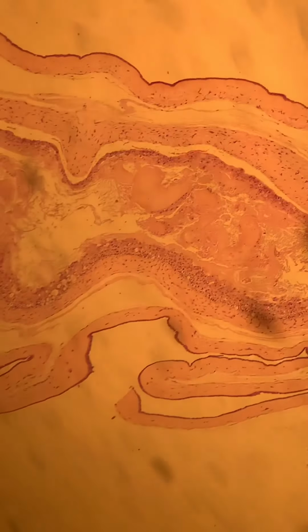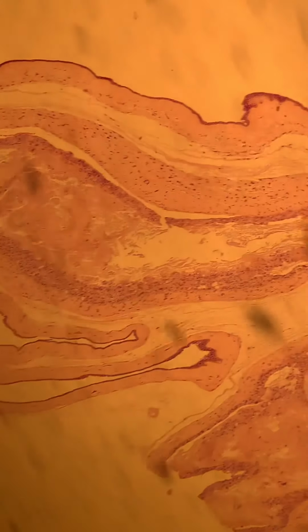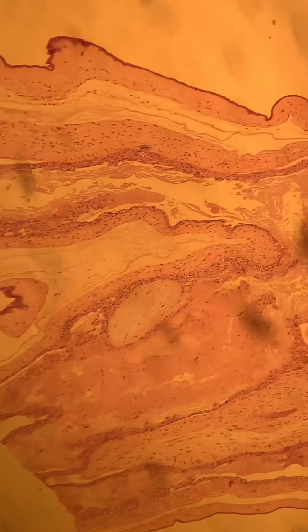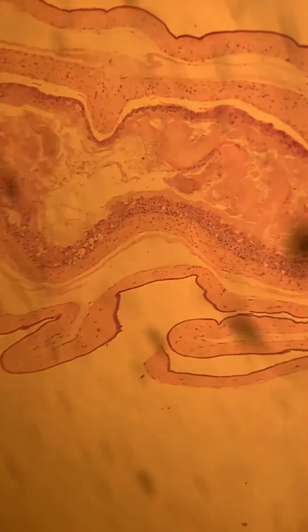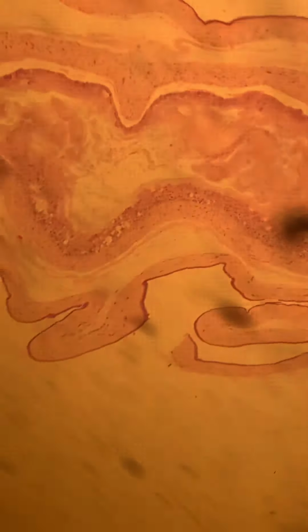The membranes from the transitional zone don't look as bad. But I want to stress that because there are some other pathologies that I'm going to show that highlight what I want to prove here in terms of the conditions surrounding the death of this fetus, this twin B fetus. Okay, so twin A survived and twin B died. So we will begin by showing you the umbilical cord from twin A.